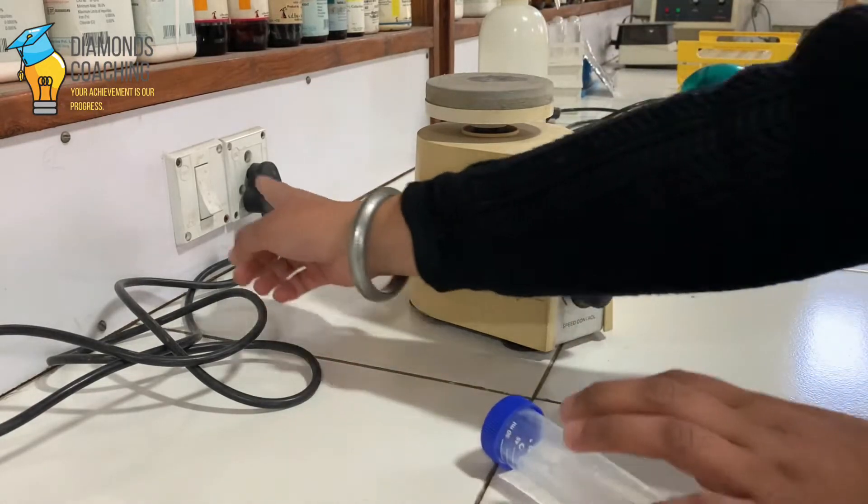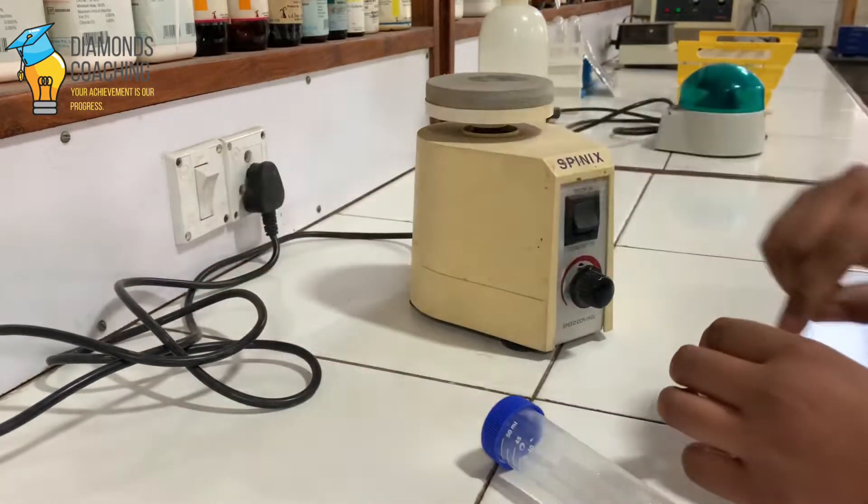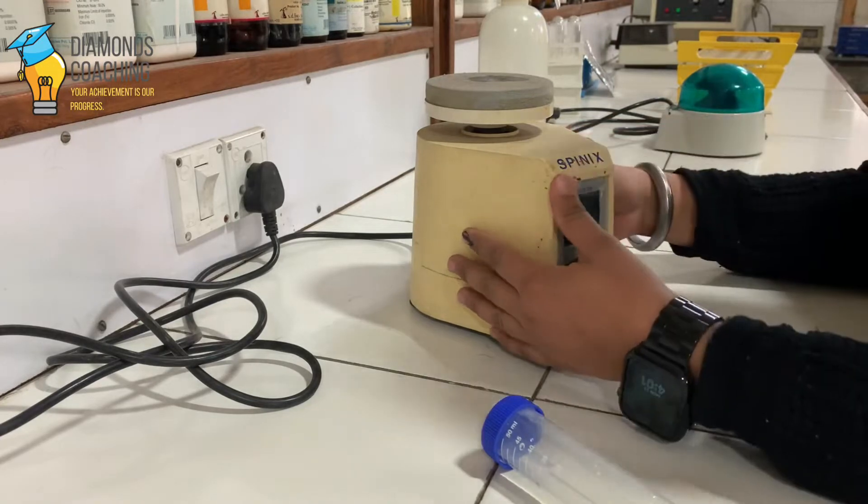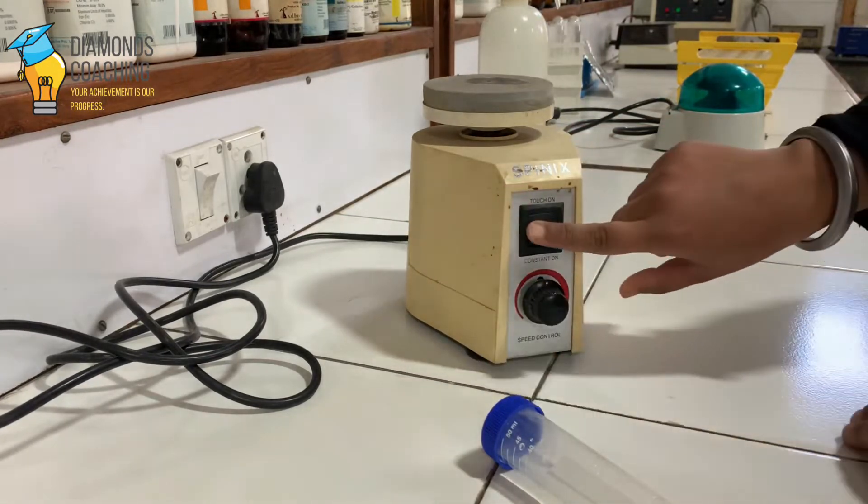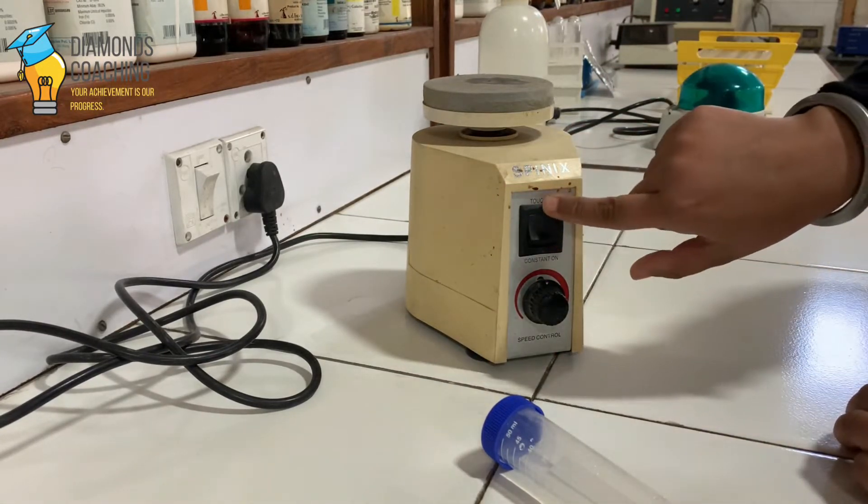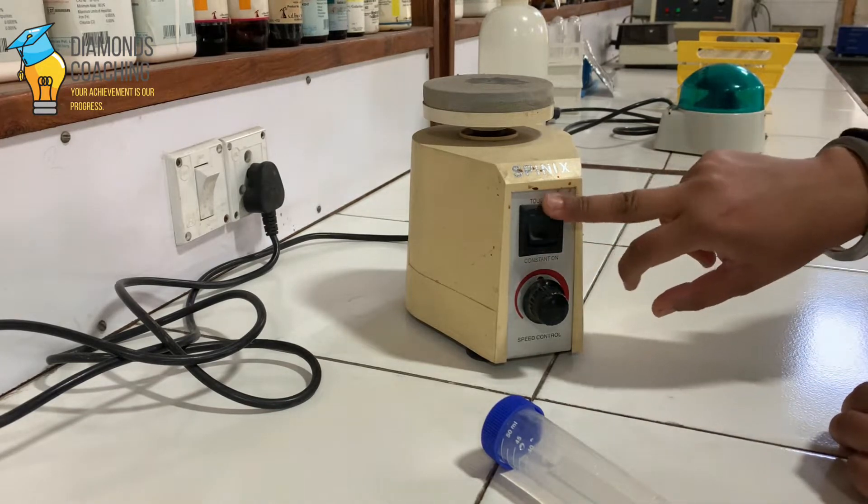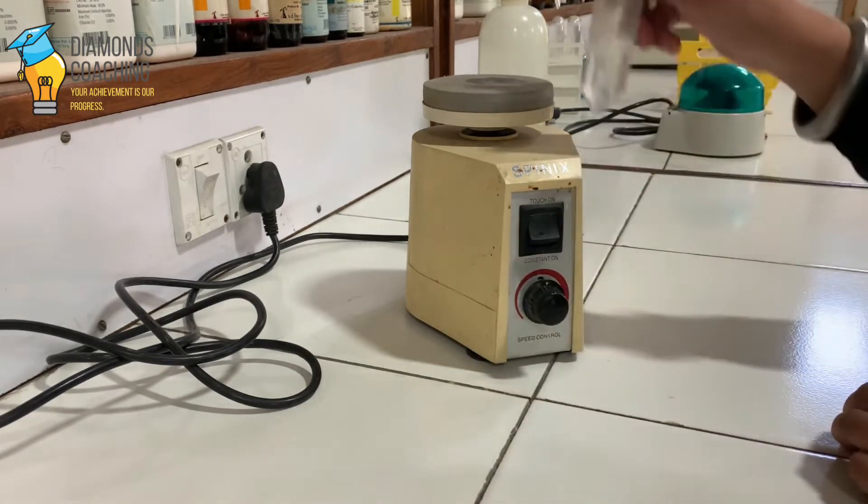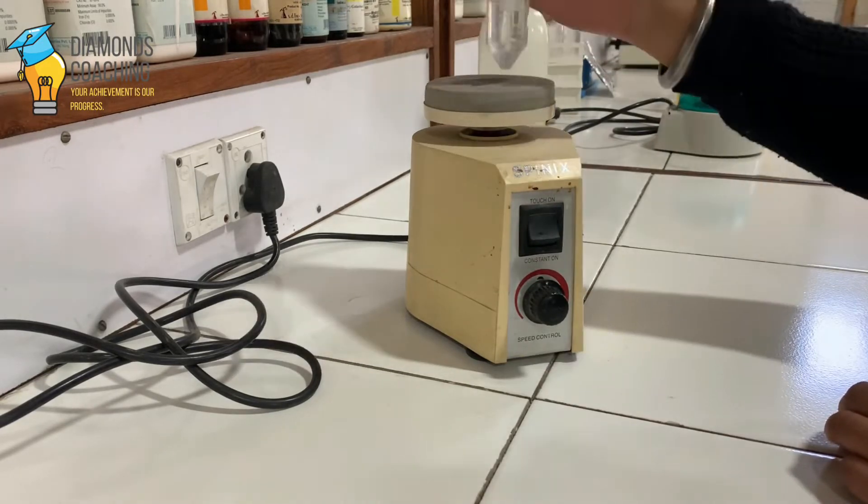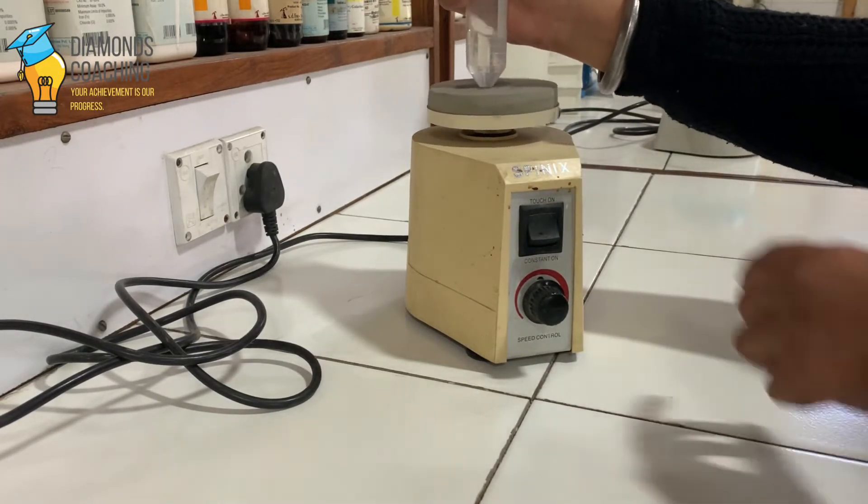So here we switch this on and it has two options: touch-on or constant-on. If we do this touch-on, then it would work only if we place this vial on it. So when we touch this vial it will move. Because the speed is very slow, that's why it's not moving.